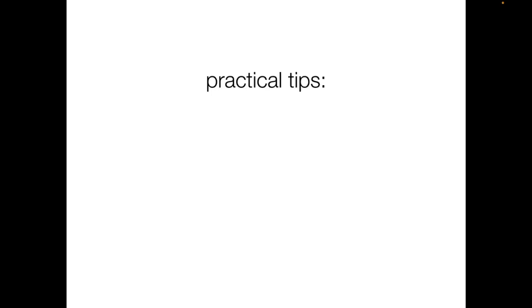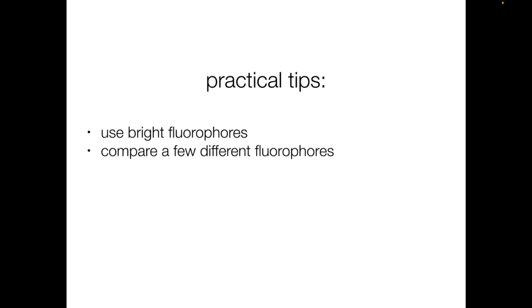Here are some practical tips. First, use bright fluorophores. The brighter the fluorophores, the less excitation light you'll need to generate a usable image. If you were to use a dim fluorophore with similar photostability, you'd need more excitation light and you'd end up with faster photobleaching. Second, try a few different fluorophores rather than sticking with the first one you find. Measuring and comparing the innate photostability of fluorophores is difficult, but comparing the photobleaching rates at your own microscope is straightforward.